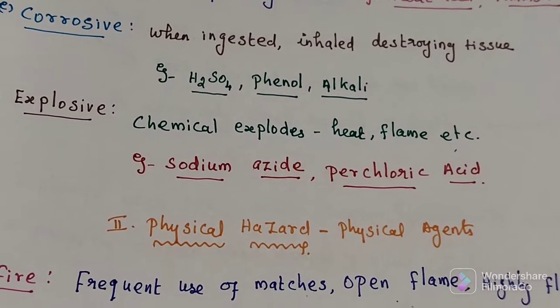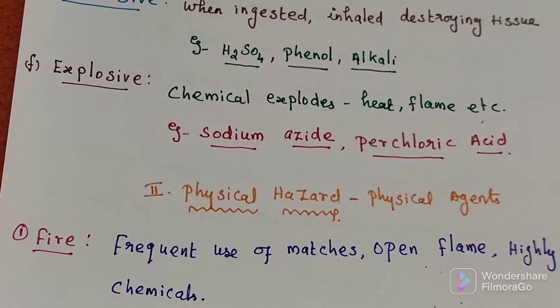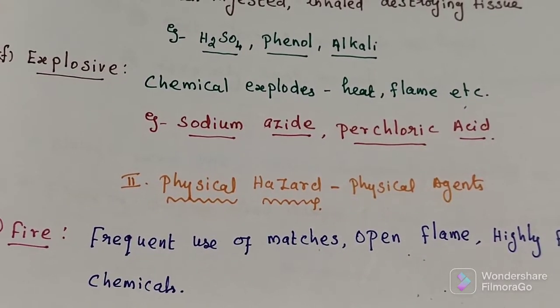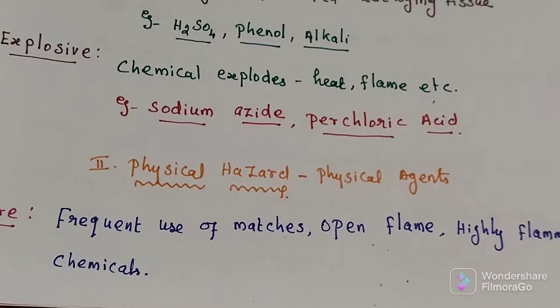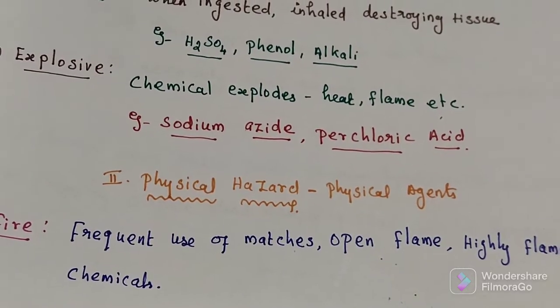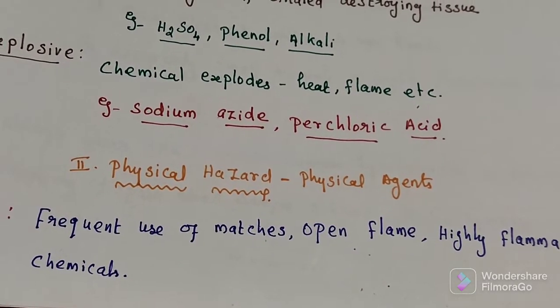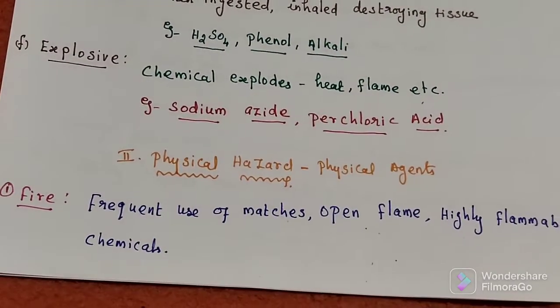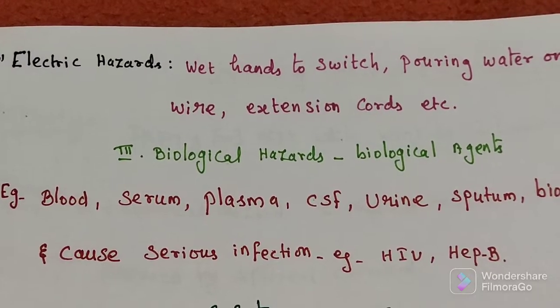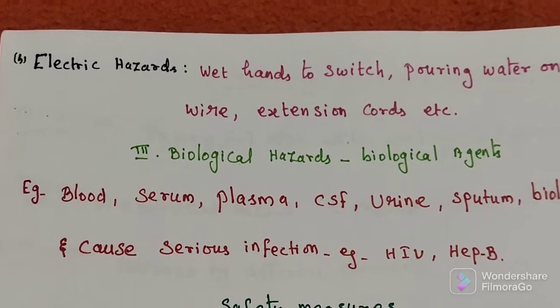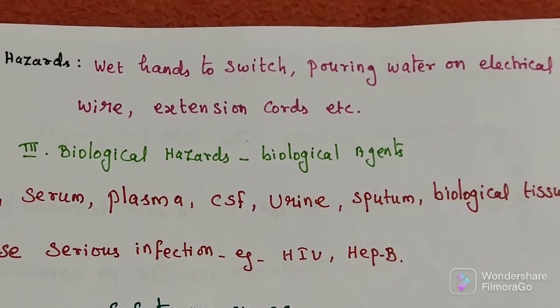The next category is physical hazards — hazards acquired by a physical agent. There are two types. First is fire, due to frequent use of matches, open flames, and highly flammable chemicals, which is responsible for fire risk in the laboratory. Second is electrical hazard, which can occur from touching switches with wet hands or pouring water on electrical wire or extension cords.